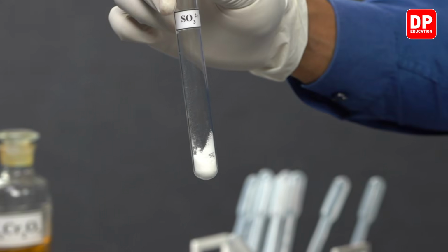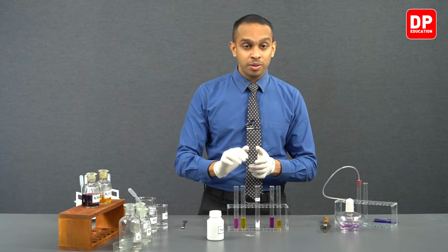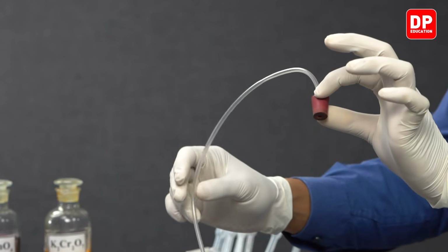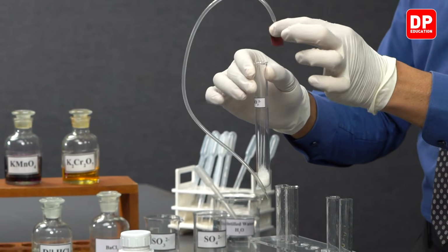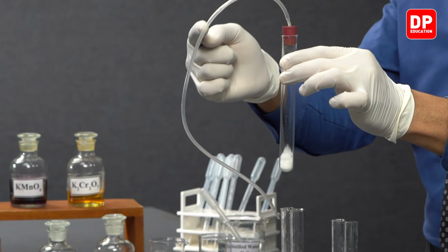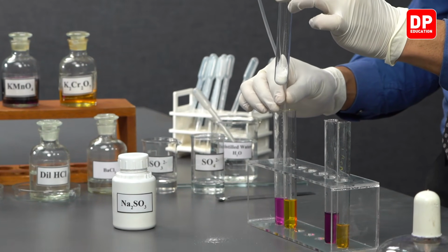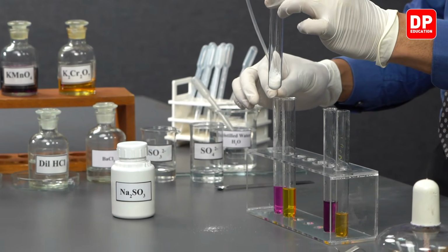After taking a little bit of sodium sulfite into this test tube, we are going to be ready with a delivery tube with the rubber stopper attached to it, so that as soon as we add HCl to this test tube, we can connect the rubber stopper and the produced sulfur dioxide gas will be delivered through this delivery tube into the acidified potassium dichromate solution, and after we observe the color change, we can move on to the acidified potassium permanganate solution.